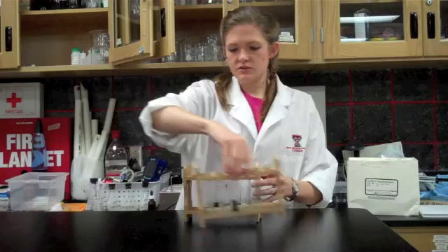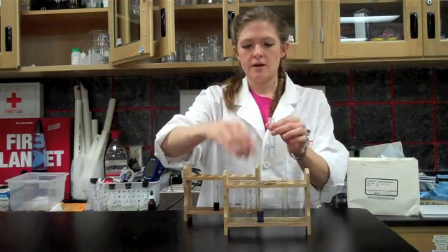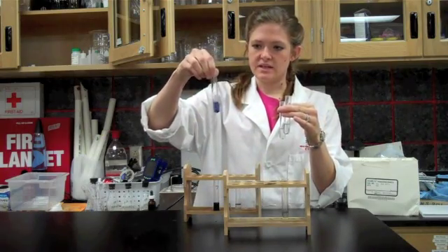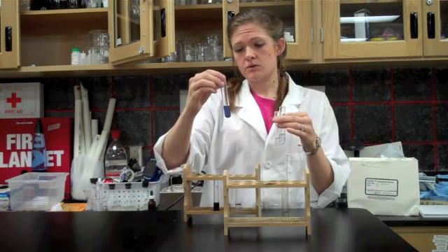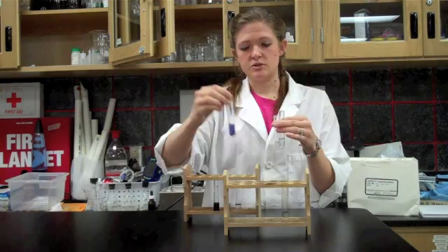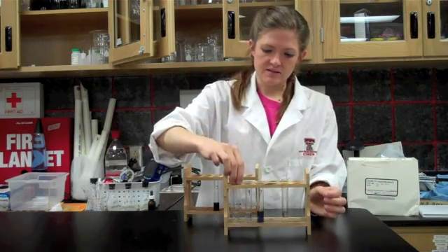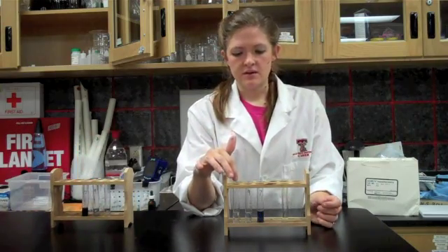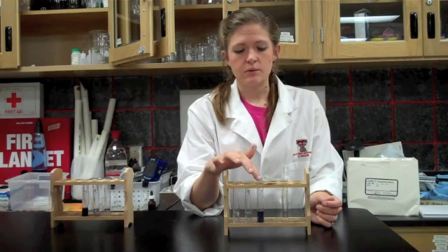After a long time, solutions 11 and 9 will turn almost clear in color, because all of the starch has been turned into sugar. But solution 7 takes a very long time — eventually it will turn clear, but because the pH of 7 is so difficult for the amylase, it takes a long time to work. So we can see that the amylase works best in the pH 11 solution, works okay in the pH 9 solution, and works very slowly in the pH 7 solution.